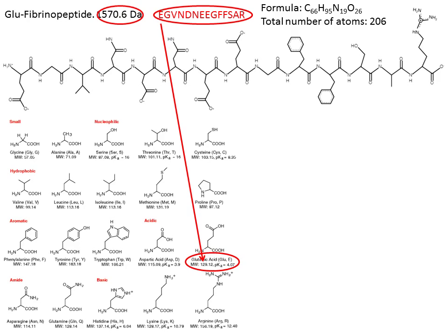This is where the mass spectrometer becomes useful. Mass spectrometers measure the mass of ions, which are charged particles. So unless you can either add a hydrogen atom to an amine or remove a hydrogen from the carboxyl group of a peptide, you cannot measure its mass.